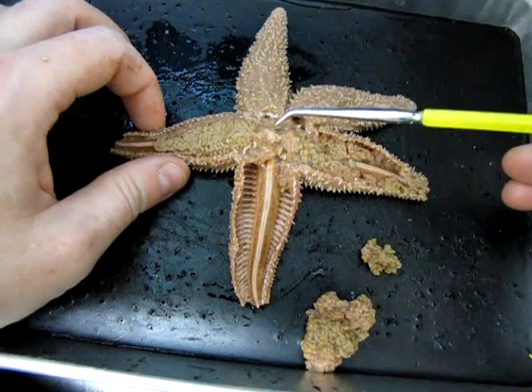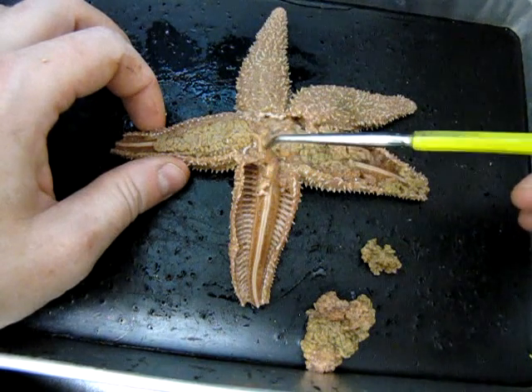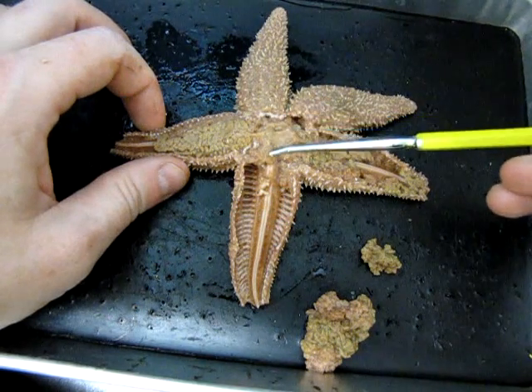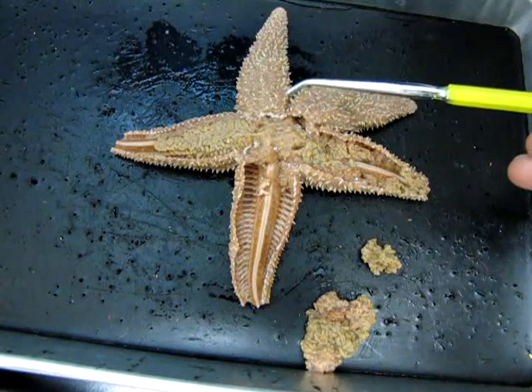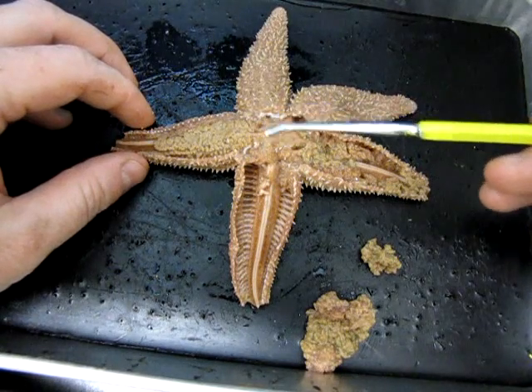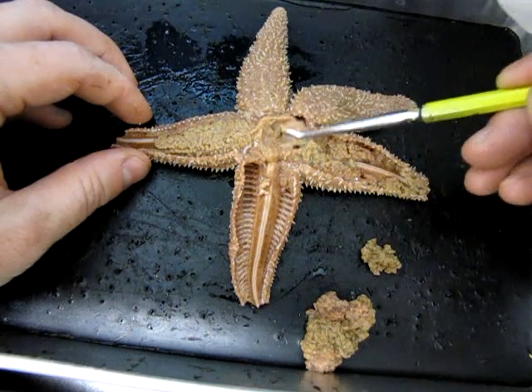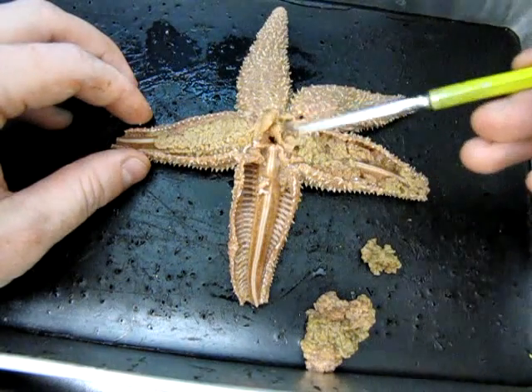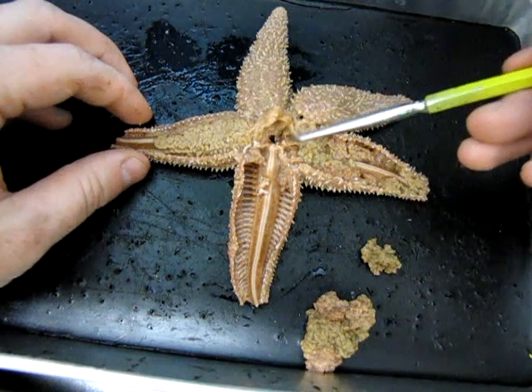Looking up into the area of the central disc — it's a bit of a mess — there are some significant structures here. This very soft, spongy mass was part of the digestive system: it was a stomach. The stomach is actually a two-chambered structure. The one on top is called the pyloric stomach, and underneath that we may be able to see some remnants of what is called the cardiac stomach. It's a little difficult to see clearly with this specimen.